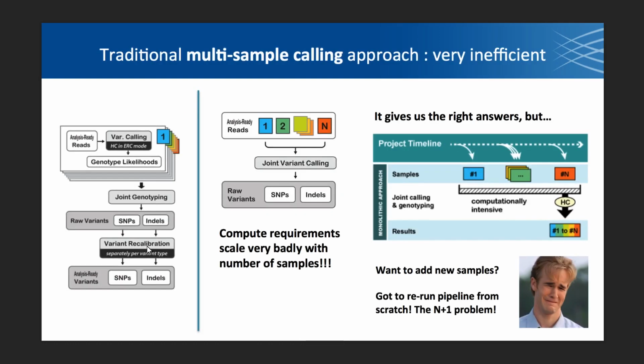So our multi-sample calling right now is in what we're going to call GVCF mode, or reference confidence mode, which we'll practice in the hands-on sections. And in this updated version of our best practices, each sample is run through HaplotypeCaller by itself, and it produces an intermediate output that we can hold on to and then combine with other samples later on, which is very useful for calling large cohorts, especially if you're going to do them in batches.